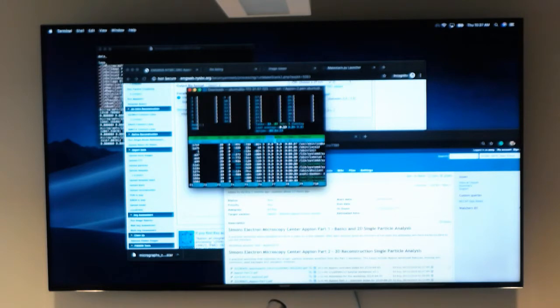Something to make note of, we only have roughly 100 gigabytes of space in this particular instance, because a lot of the other space was taken up by test data sets and installing RELION. So depending on how aggressively you start generating data, you'll max out at a certain point.